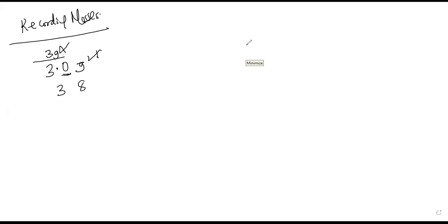It is not mandatory that it is 1 dp. I've said depending on the scale you are using. I don't know the scales at our different schools. With my students, we record it to 1 decimal place because the weighing scale we use has a calibration to 1 decimal place. Okay.